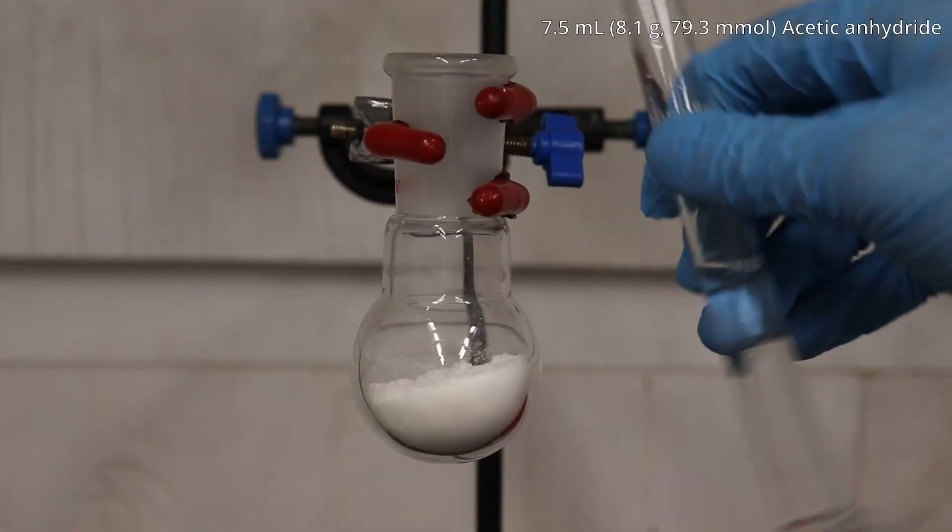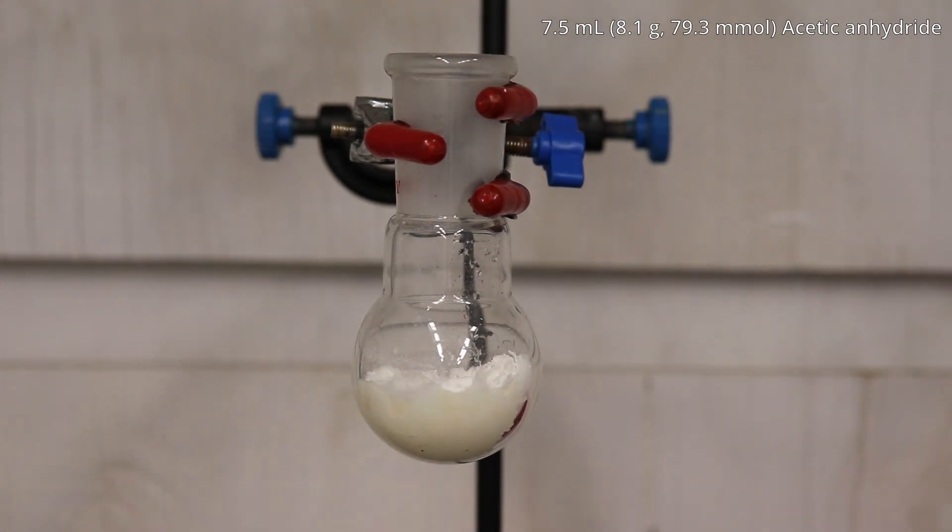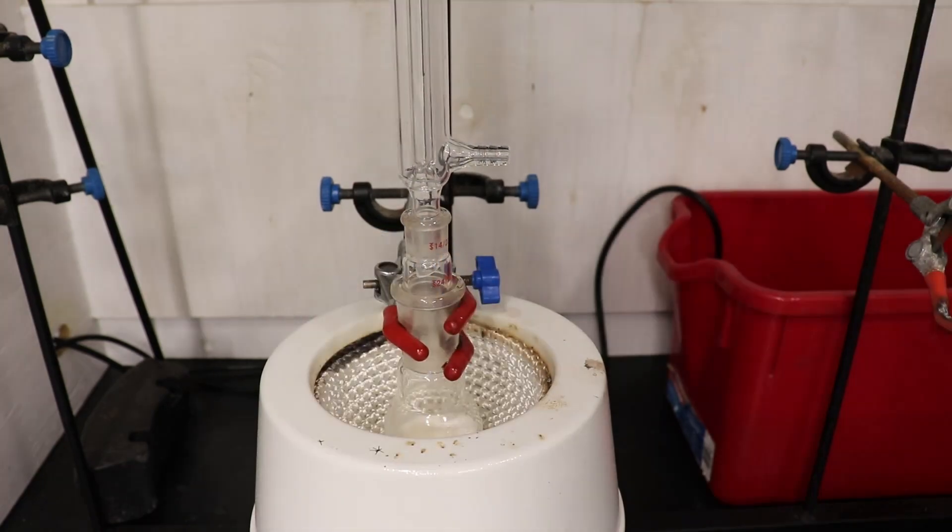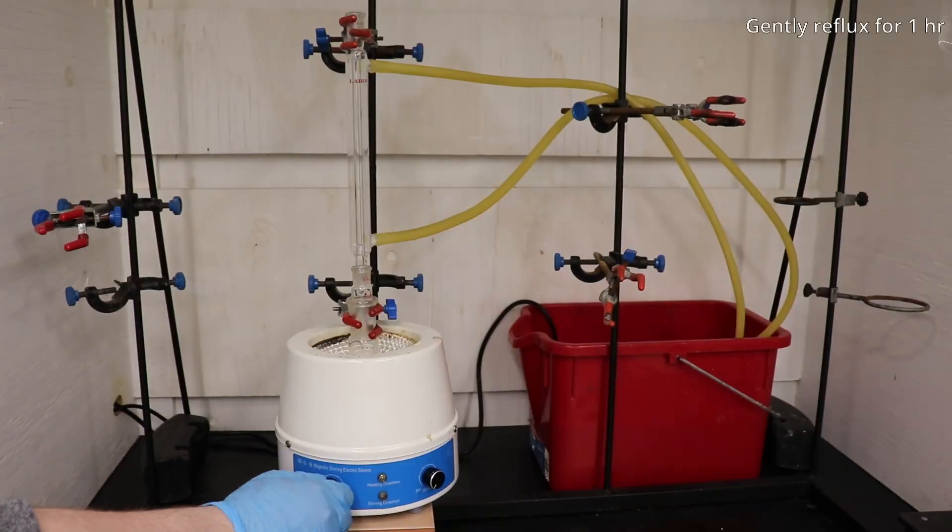This was followed by the addition of 7.5 mils of acetic anhydride. The flask was then set in a heating mantle, a condenser was attached, and the mixture was refluxed for one hour.